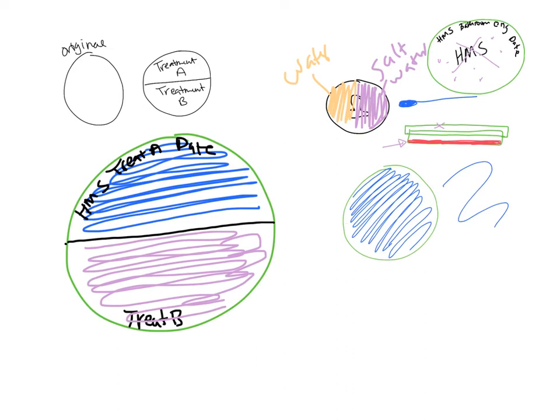So then once you're done with that, you're going to take all your plates and you'll actually put them upside down. So that way if any condensation forms, you won't have it dripping onto the colony. The condensation always forms on the lid. So if you put your lid face down, that means your agar is up, so it's not going to get any drips on it if the lid gets condensation on it.